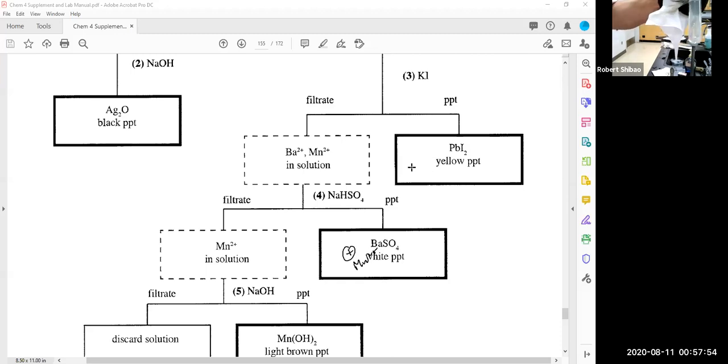It's a little bit hazy, but we would expect more, although it's pretty dilute, considering how much HCl I added. All right, but anyway, let's check for barium ion next. We're going to check for barium ion by adding sodium bisulfate. So let's add some sodium bisulfate here.